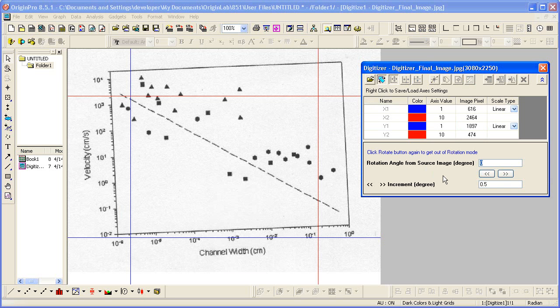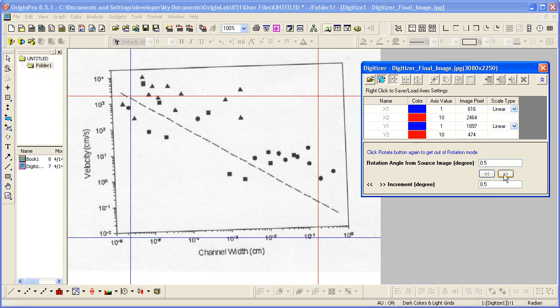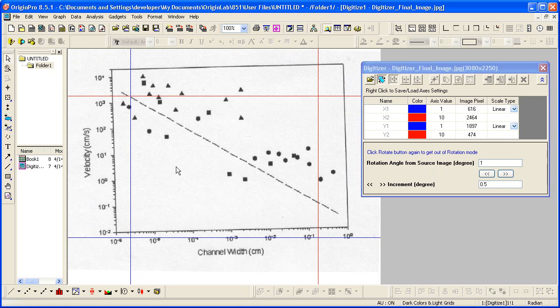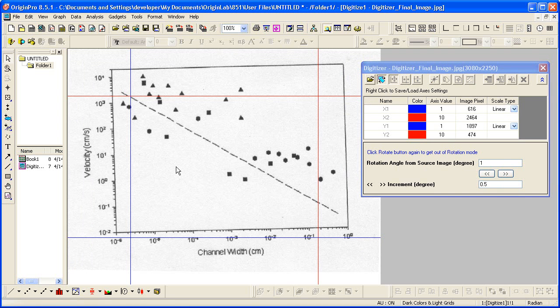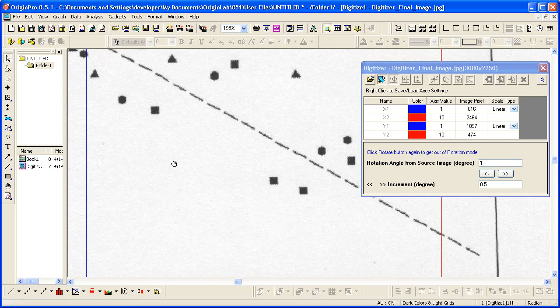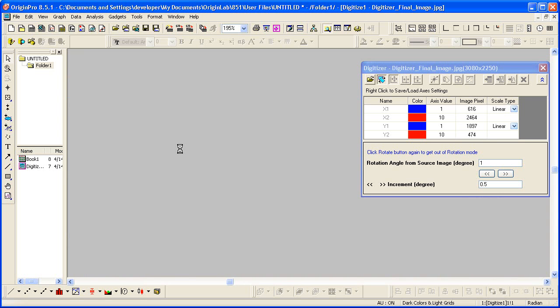it will allow me to rotate by 0.5 degrees here. We can specify this. So let's click a couple times, and now it might be a good idea to come to the graph, make it active, hold down the Z key on the keyboard, which allows me to use the mouse scroll wheel to zoom in on the graph.